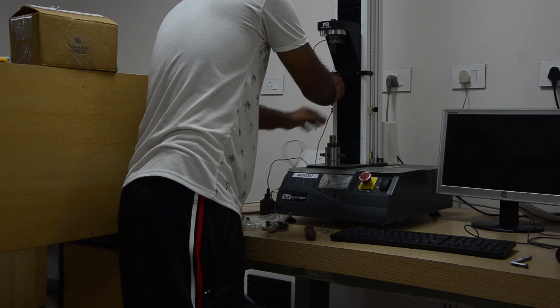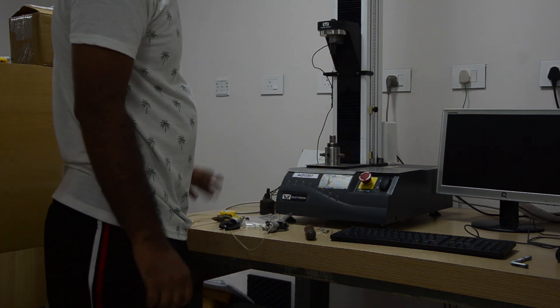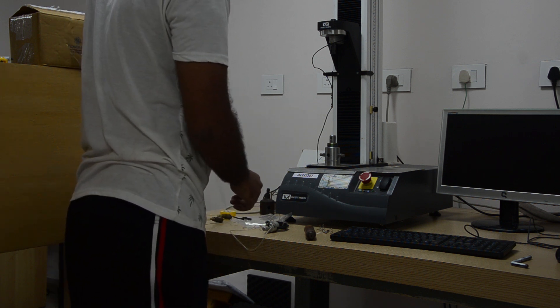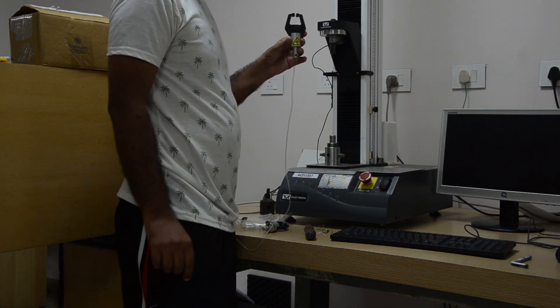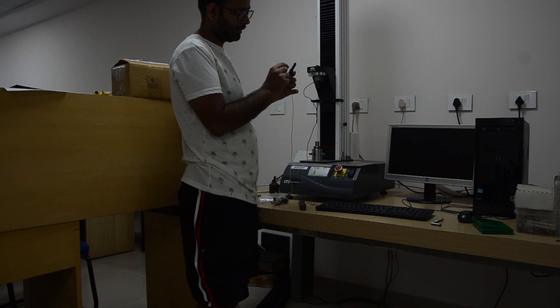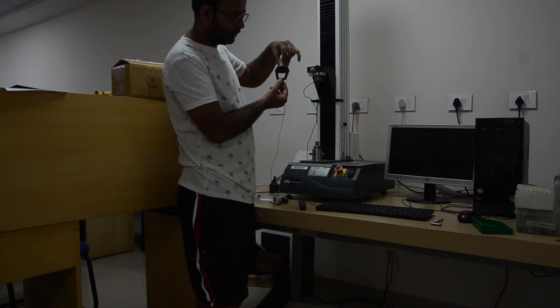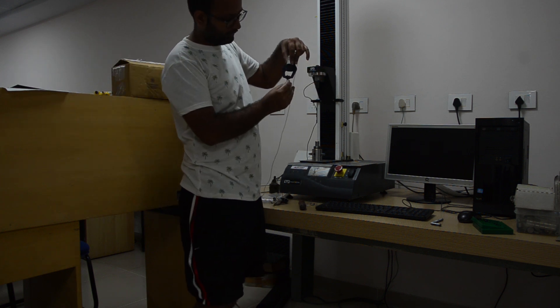I am arranging this so it will go up and down. These are the pneumatic grips. While making the single fiber sample specimen, I told you the tab dimensions. It will go and hold the sample like this.